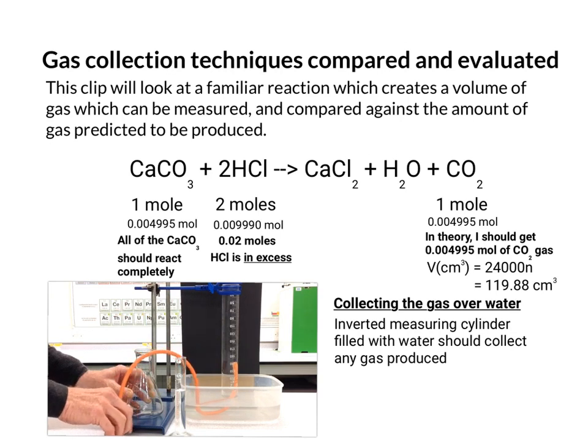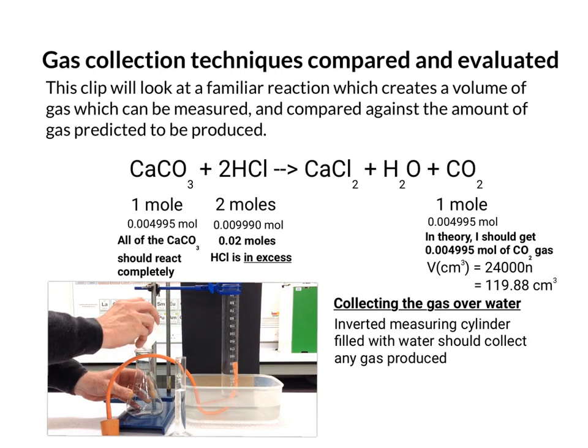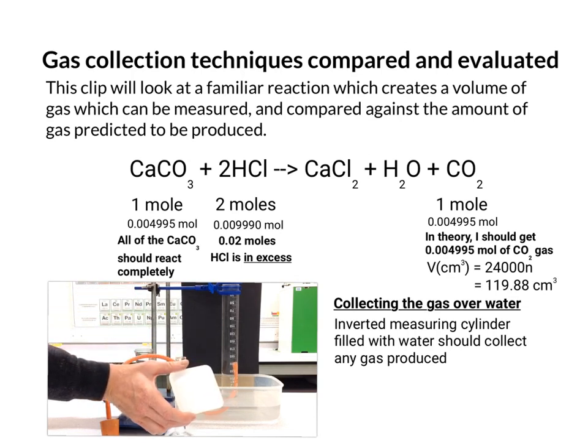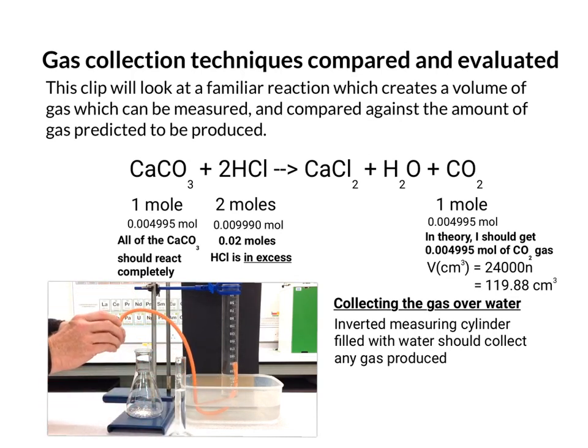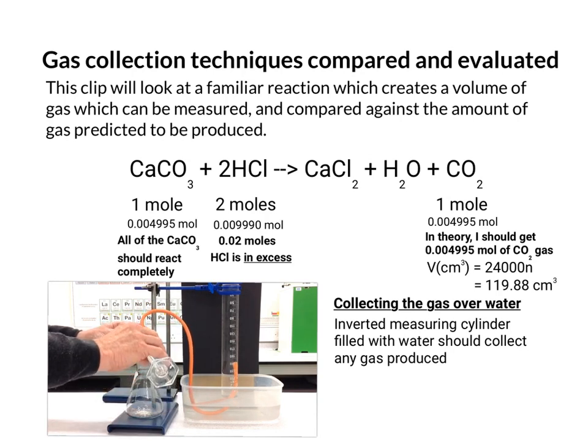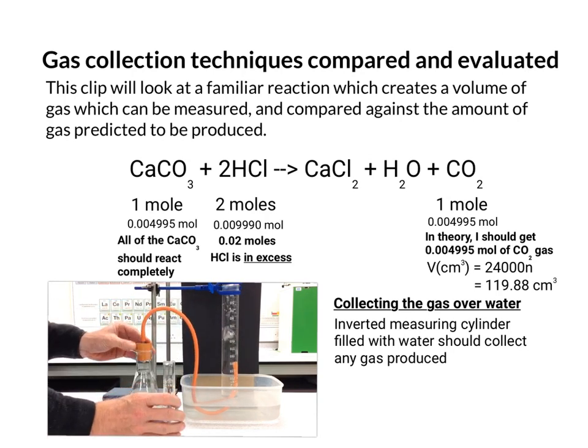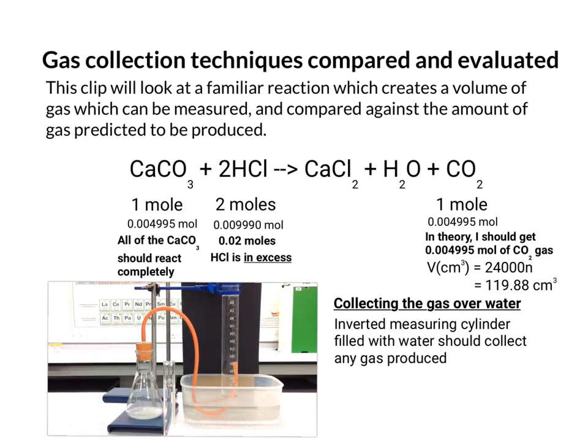So I take off the bung, obviously, to get access. I'm going to tip my calcium carbonate fully into the reaction vessel. Just to see that it's all gone. So I'm going to pour the acid in. And with my left hand, have the bung ready so I can seal the top as quickly as possible. So I'm going to give it a shake just to see how much we can get. You can see it going down to almost 50.